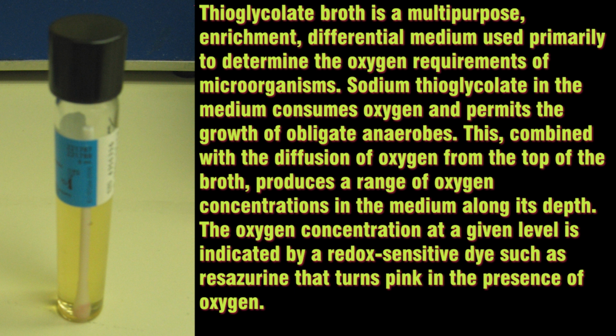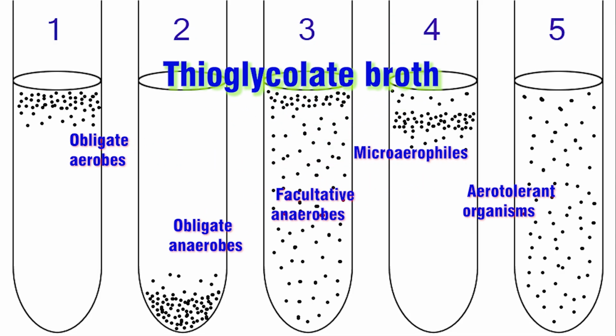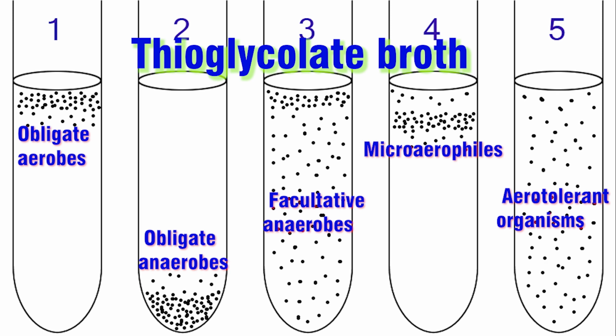For bone, the Gram stain is done. Blood agar, chocolate agar, MacConkey agar, and thioglycolate medium are used for inoculation.